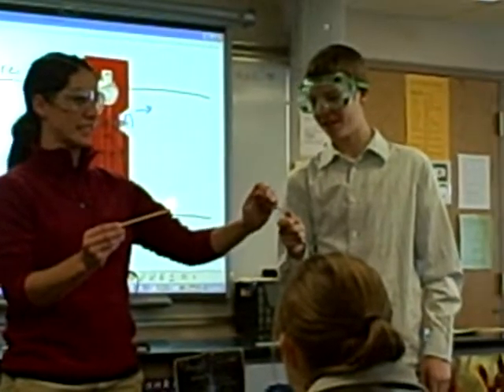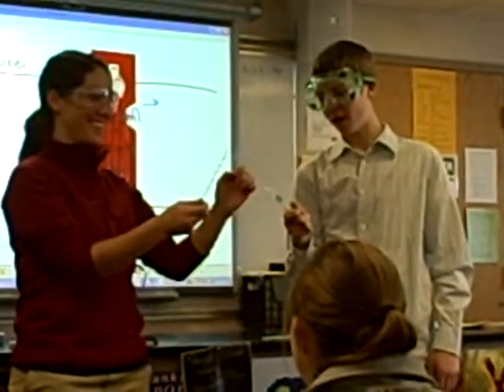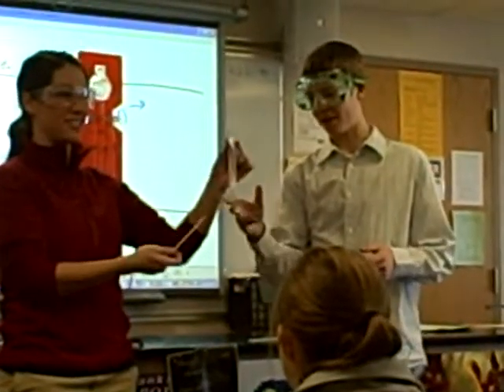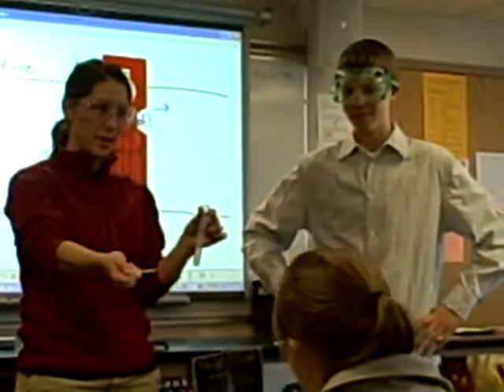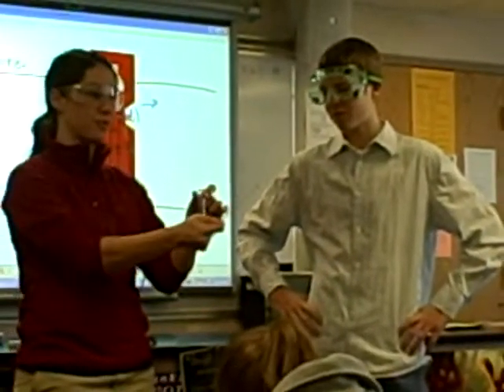Ready? Advantage point. Uh-oh. Oh no. Whoa! Okay, so was that hydrogen? Yeah, bet it was. Write down what happened. It went. You tested it and it went out. A flaming splint for hydrogen proves you have hydrogen gas.